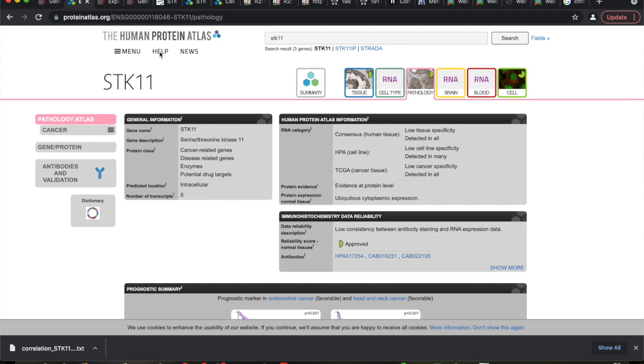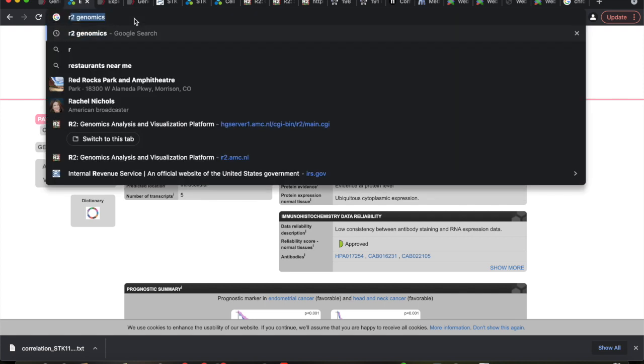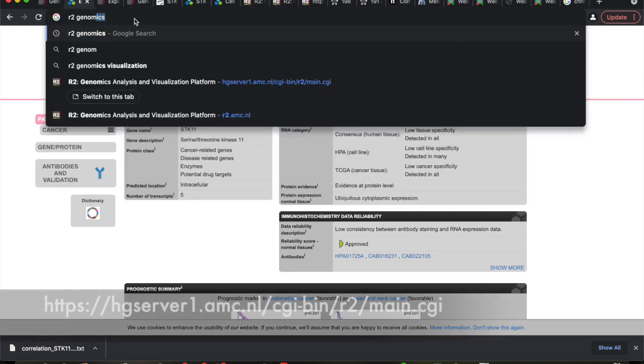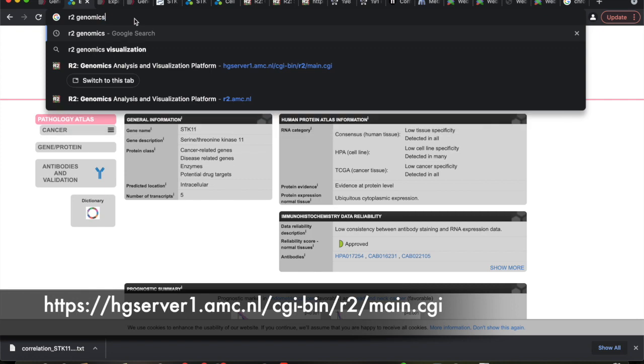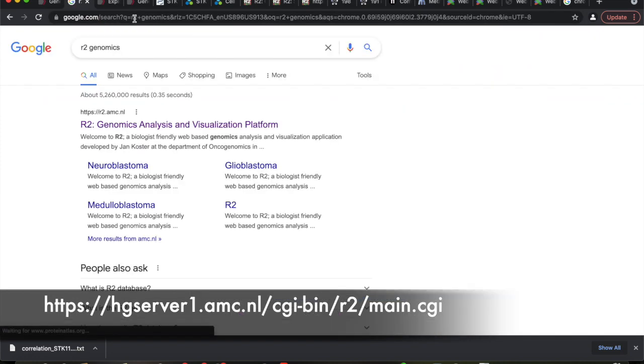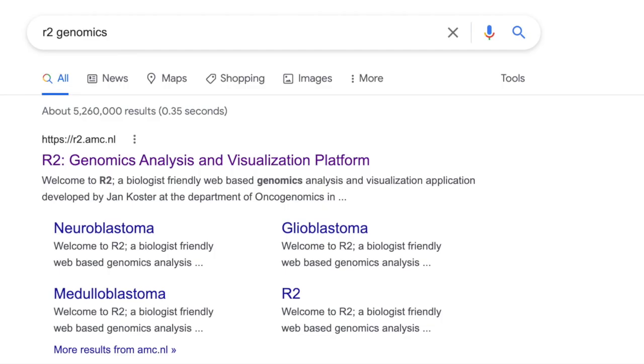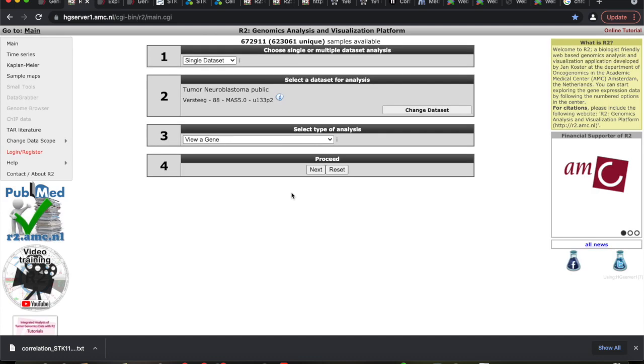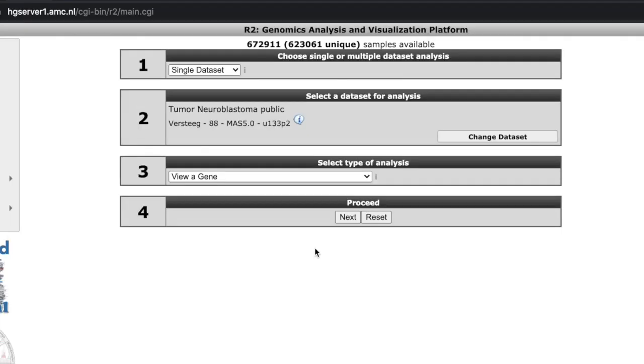Here, what I want you to do is I want you to search for R2 space genomics. Everybody do that. You should come up with a web page that looks like this.